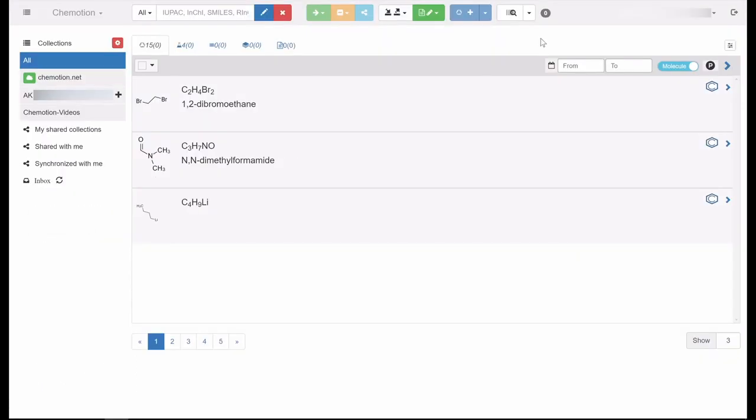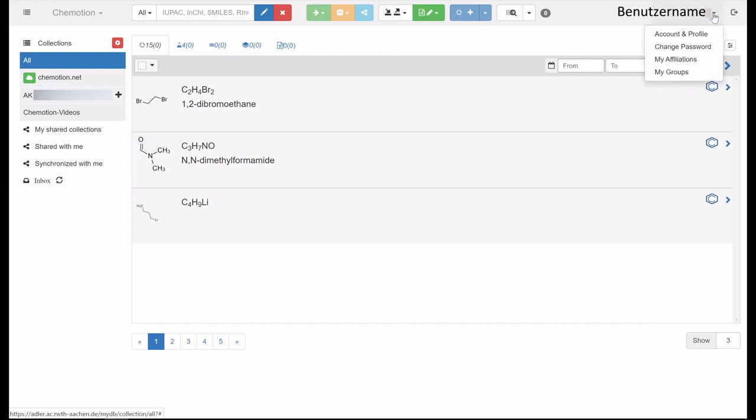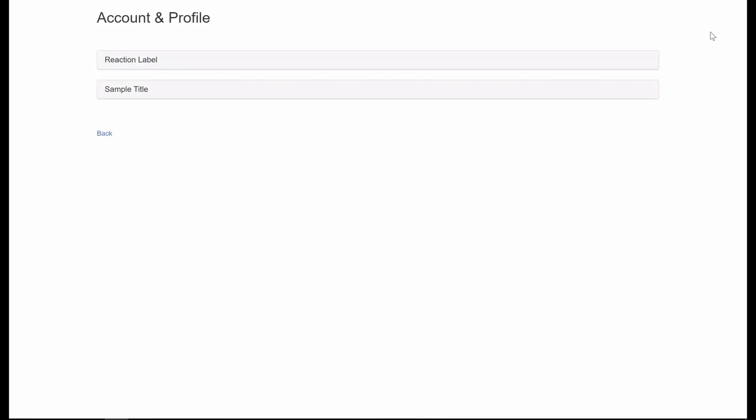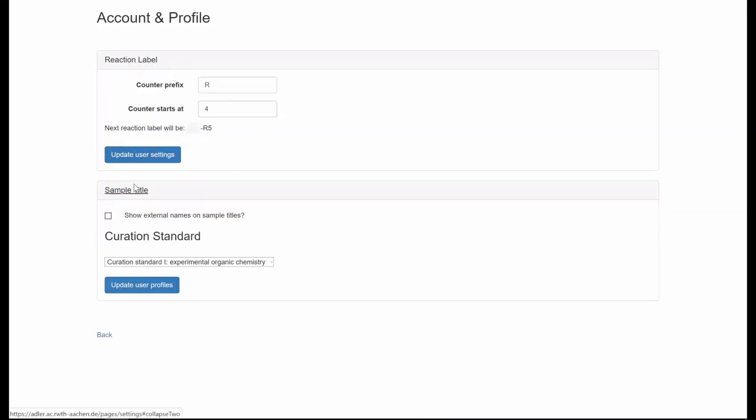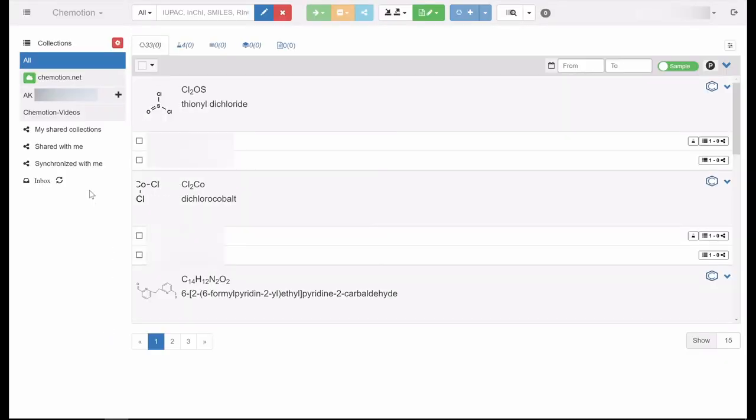You can access options for general modifications for both your profile and the electronic lab journal by clicking on your username. The category account and profile allows you to specify the naming of reactions and samples. You can change your password here as well.